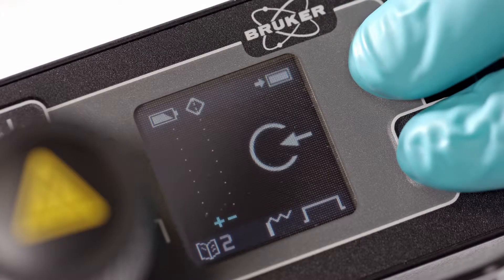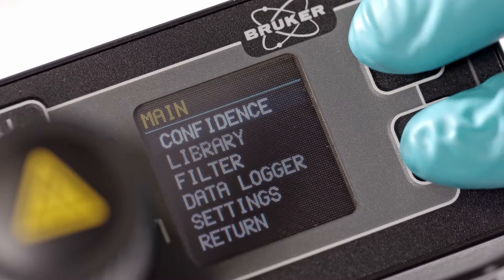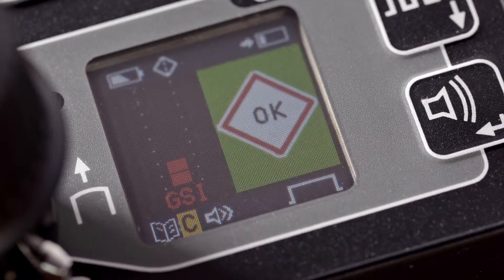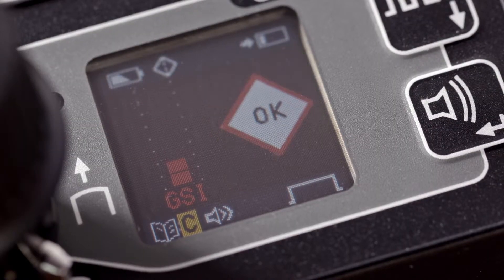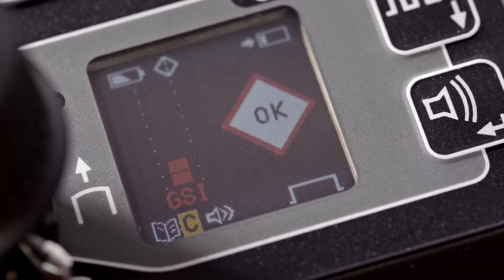A full-color display provides essential information to the operator, including threat identification, relative concentration and unknowns.